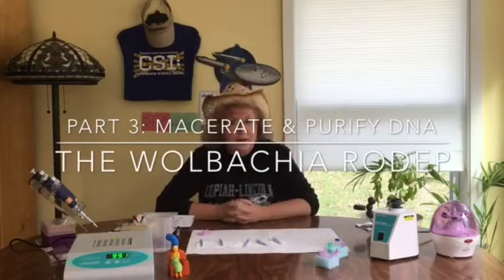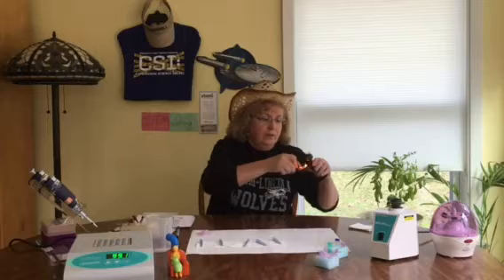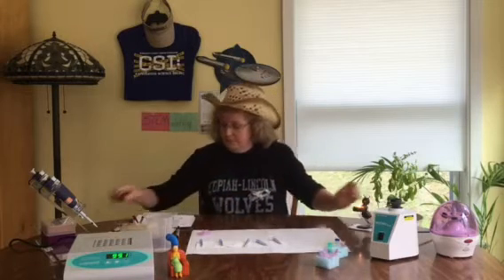Welcome to part 3, where we will learn to macerate, extract, and purify the DNA. I'm Lucinda McKenzie, and here's my friend Oscar, the fire ant.